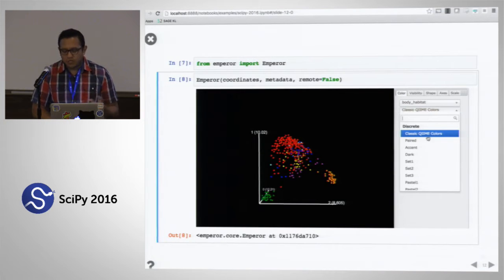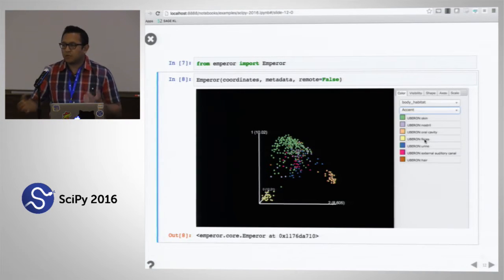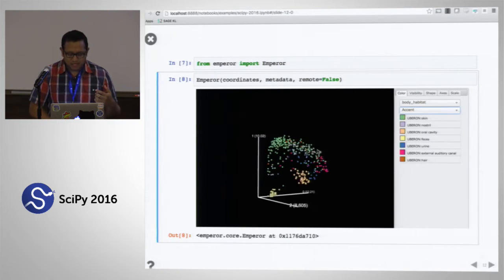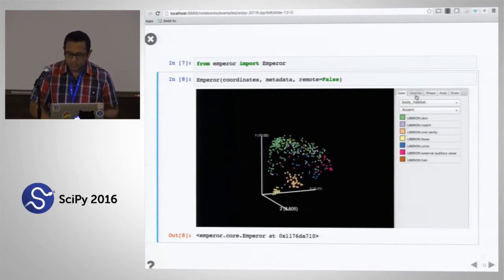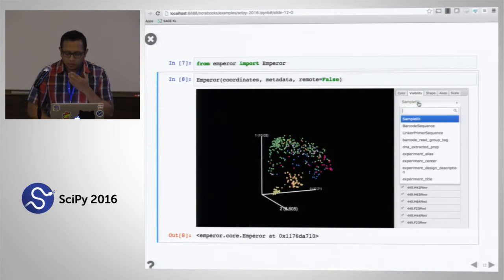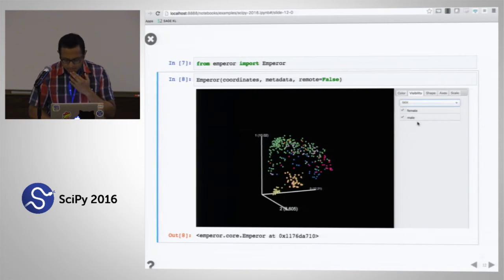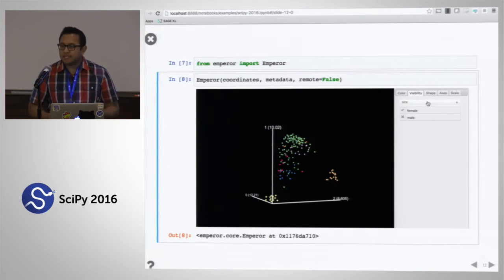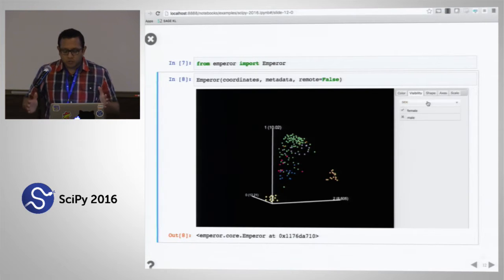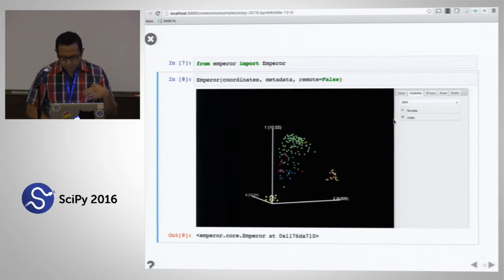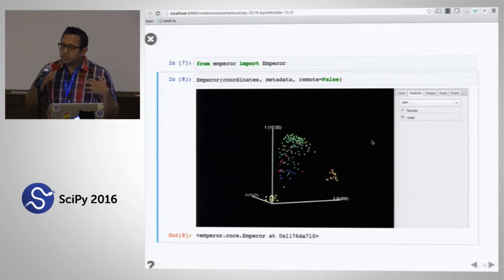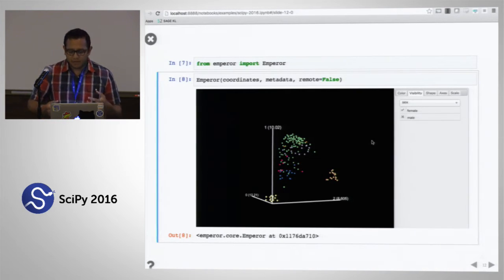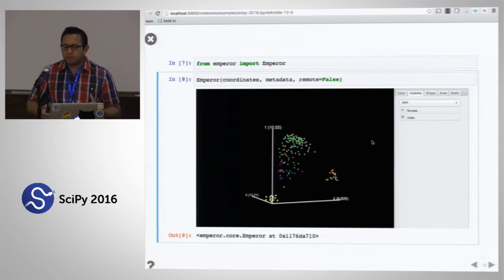One of the cool things is that you can also change the color maps interactively, just as you would in Seaborn or Matplotlib. You can also hide all the samples from, say, male subjects — now all those samples are hidden from the ordination. In this way you can have orthogonal control of all the different metadata categories in your ordination, in the browser, interactively, which is very valuable because most of these analyses start as exploratory in nature.